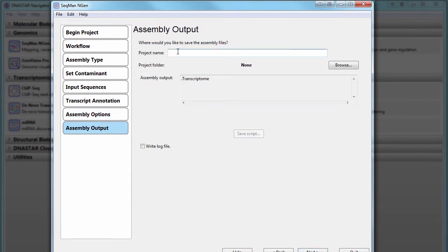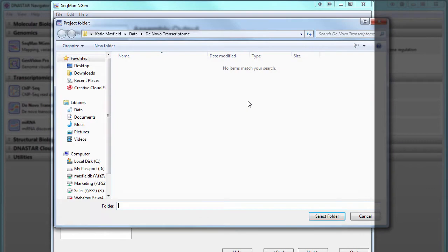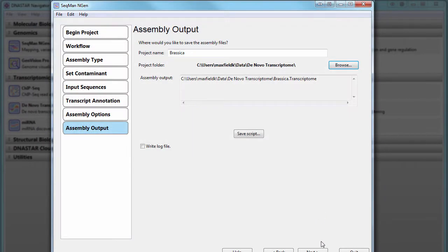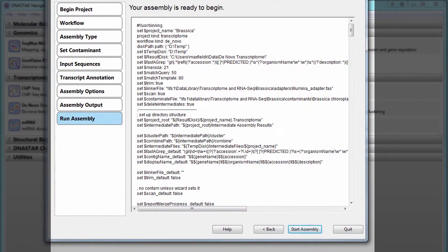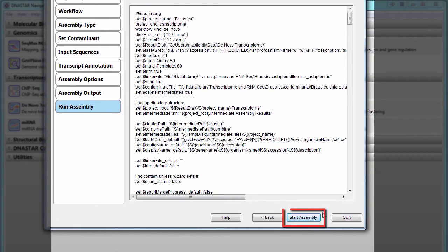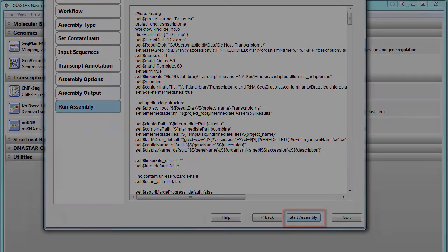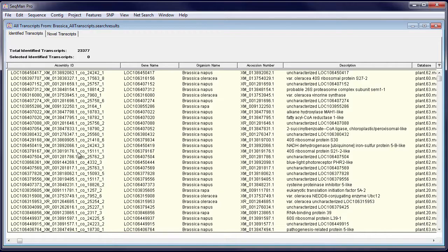Next, name your project and specify a save location. Now start the assembly.